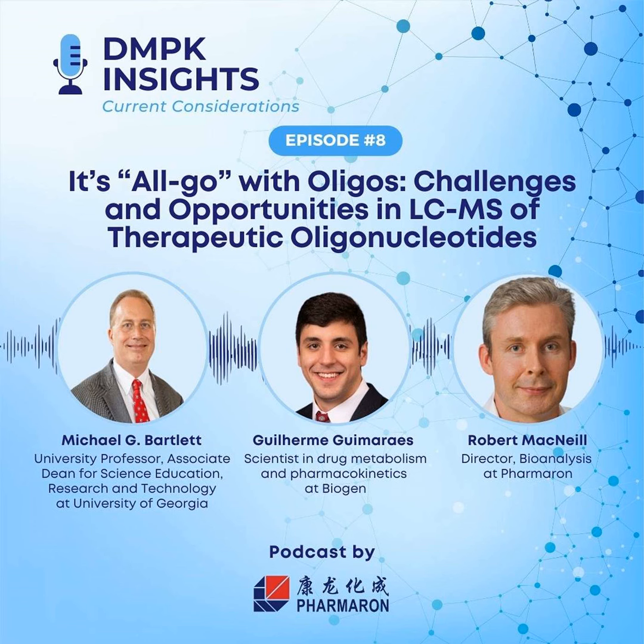I like the fact also that it seems entirely intuitive, if that's the word. There's not much out there that's more polar than oligonucleotides. And HILIC seems, from a superficial perspective, the best option to go with from the offset. Of course, the whole situation is more complex than that, but with that principle in place, it's attractive from that angle alone.